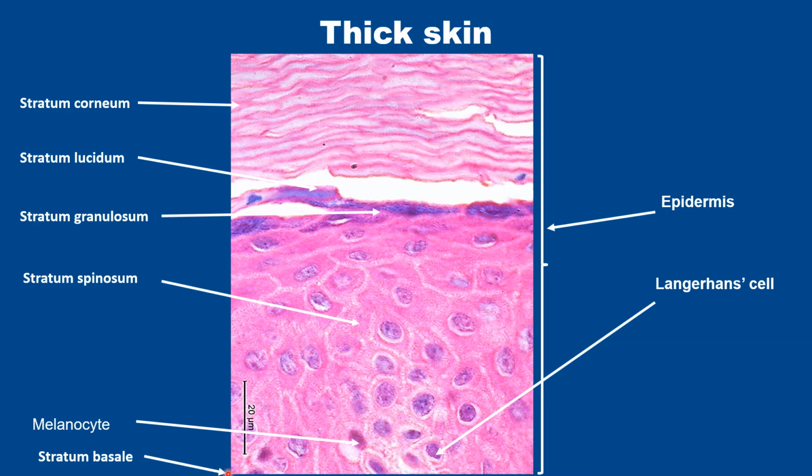Now the stratum basal has not come, but certain other cells have been identified as melanocytes. The difference between the keratinocyte and melanocyte: see here, the melanocyte is darker, and there is a space around the melanocyte, because there is contraction of these cells. It creates a space around the cell. That is the only identification point of melanocyte in the light microscope. Sometimes dendritic processes can be seen.